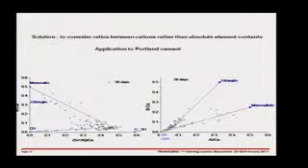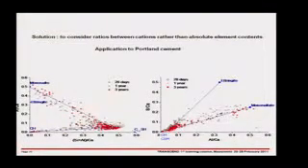So this is why we make these kind of plots, which I showed you earlier. And usually we'll see this kind of distribution. We'll see a cluster here, and this cluster here corresponds to the calcium silicate hydrate. And then these points spreading along these axes here are points which are intermixed with calcium hydroxide, points which are intermixed with ettringite or monosulfate. And we can better distinguish ettringite from monosulfate on this kind of plot here, where we plot sulfur/calcium against aluminium/calcium. And we can see how these evolve with time.